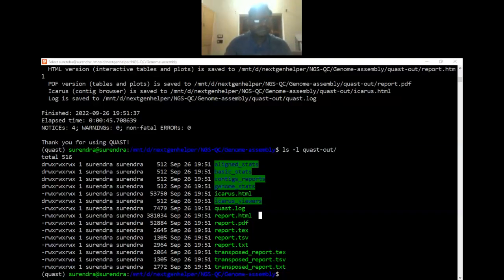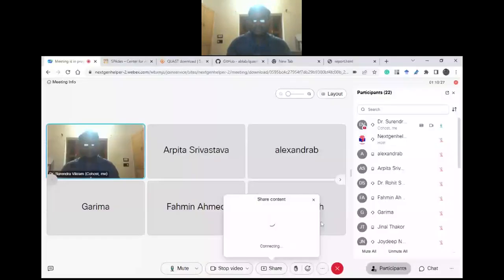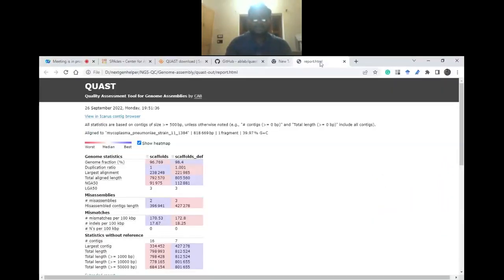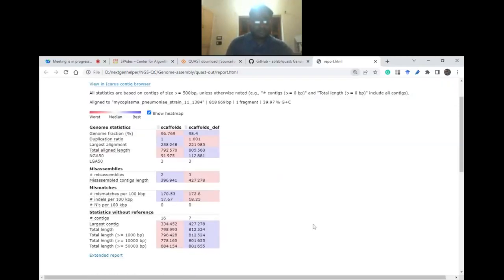Okay, let me share this. Okay, now it is shared. So this is the output here from QUAST. Okay, is it visible to you? Yes, sir. Yes, okay, sir.